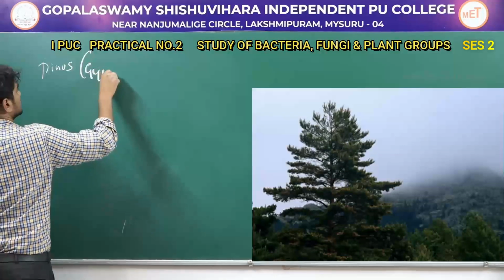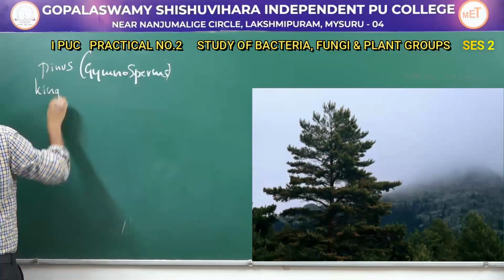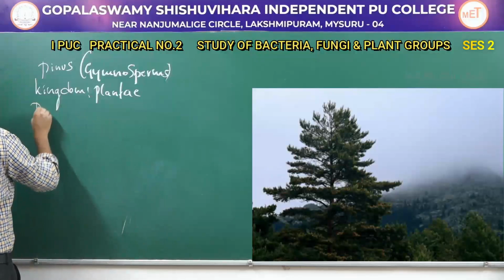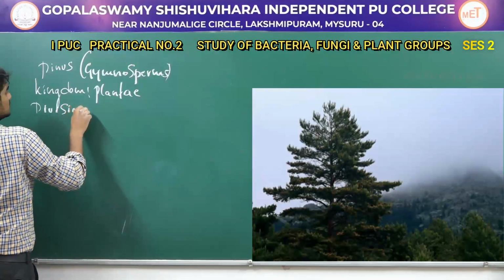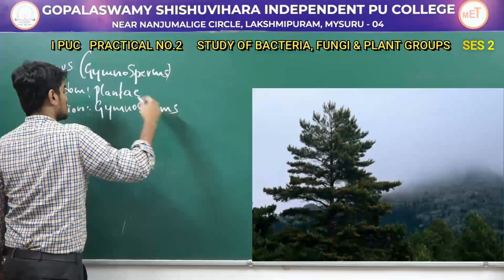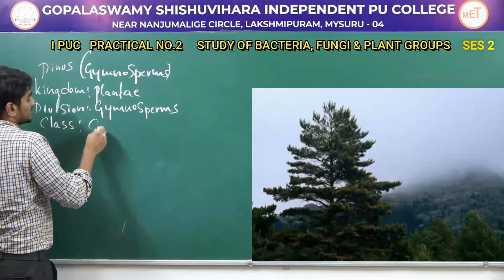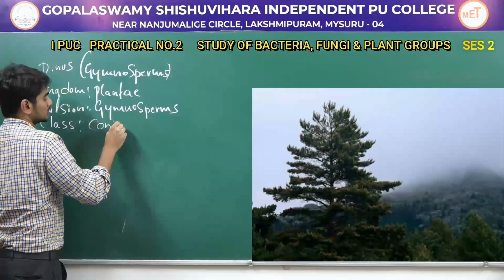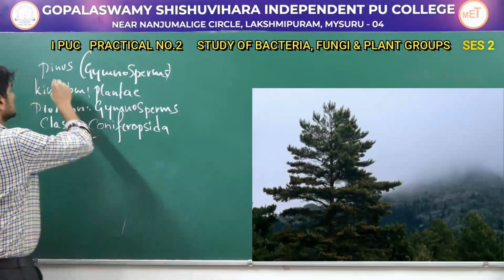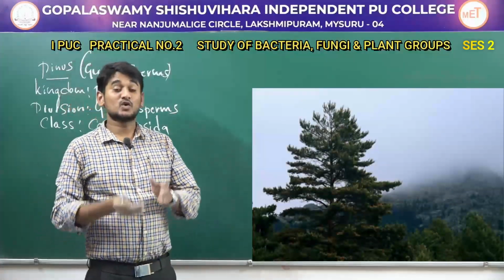Pinus, gymnosperms. Yes, this comes under kingdom Plantae, division gymnosperms, and class Coniferopsida. Yes, Pinus comes under gymnosperms, kingdom Plantae, and the class is Coniferopsida because the tree is cone shaped.